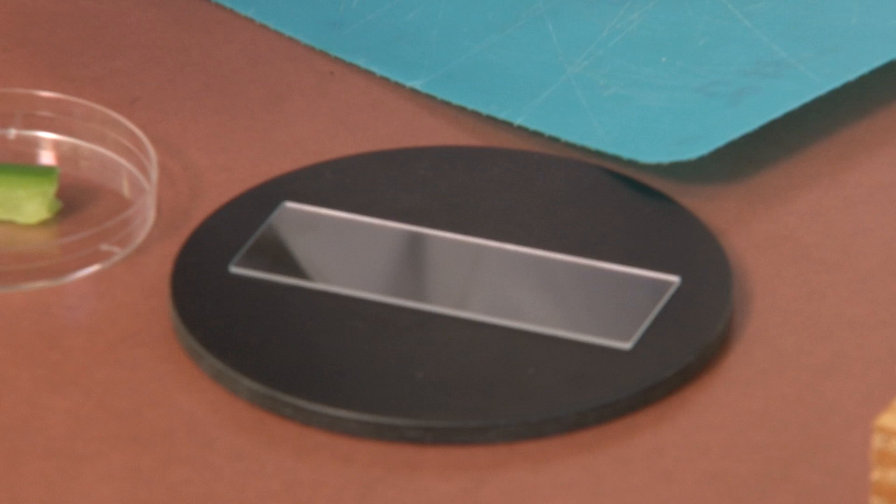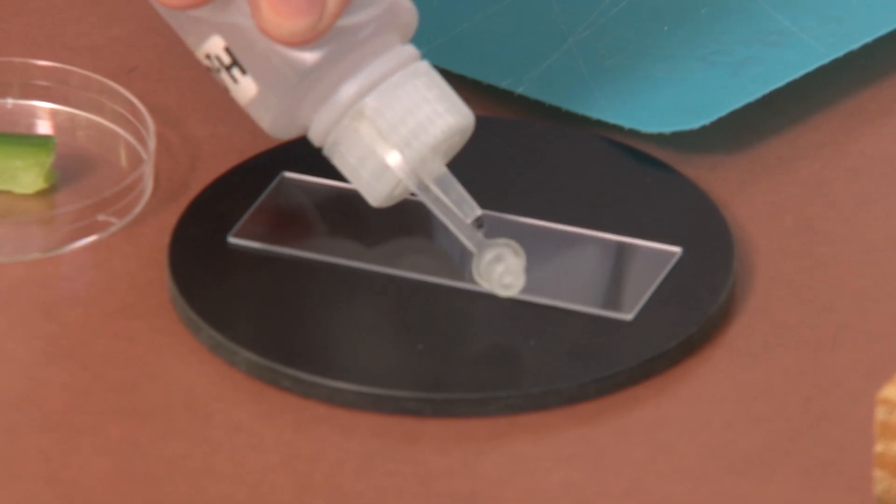Place a clean microscope slide on a flat surface. Add a drop or two of water into the center of the slide.